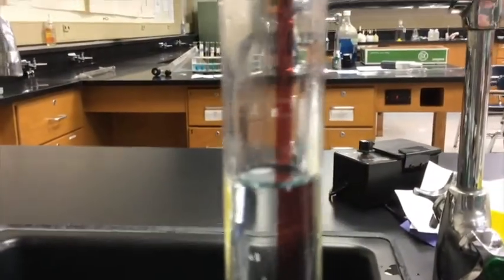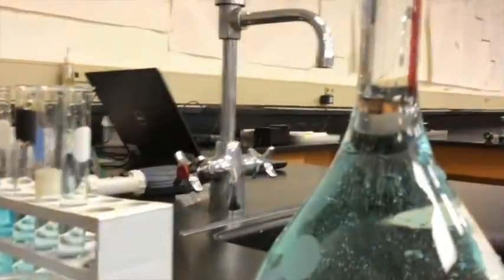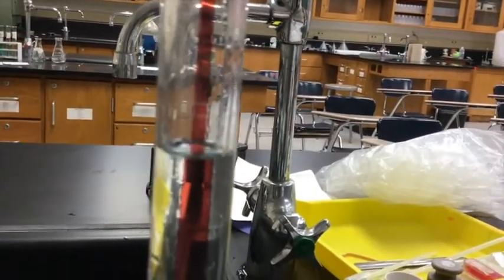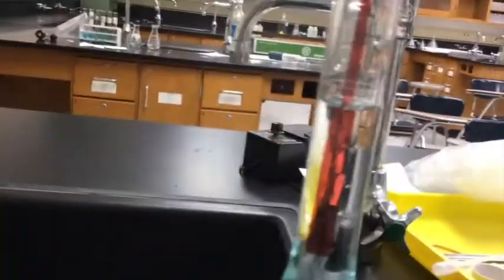I'm not quite done though. So remember that what you want to do is get this close, but then you want to get right to that line so the bottom of the meniscus hits exactly on that line. So at this point I usually use a dropper. It's tough to do this and film at the same time, so you might see a slightly different perspective than what I see. But we make do with what we have, right?